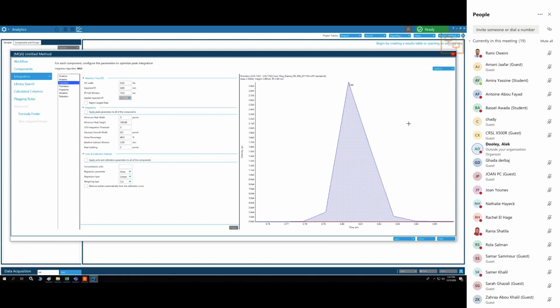So I kind of gave it away. So what would you do to your data or to your method, let's say, if you have to apply a lot of smoothing, which we just talked about is bad, you'll lose intensity. What's one thing that you can do? Anybody have any ideas? We did talk about it yesterday when we did method development, a little bit. We just touched on it.